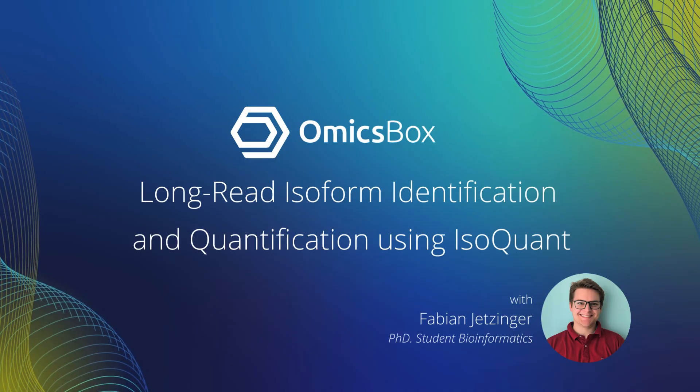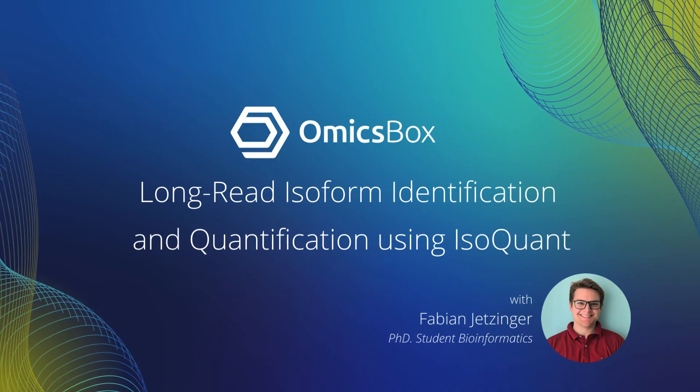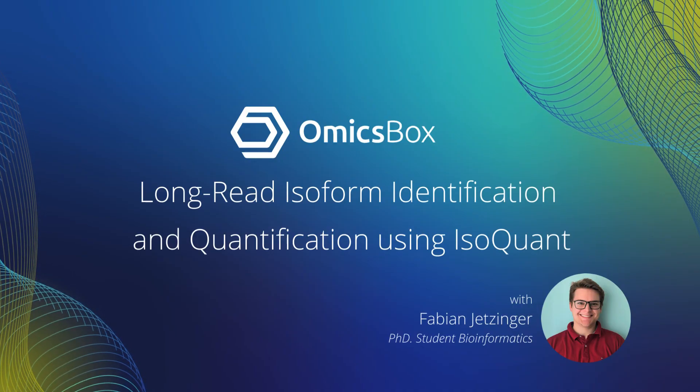Today, I would like to show you how to perform long-read-based isoform identification and quantification using IsoQuant in OmicsBox.